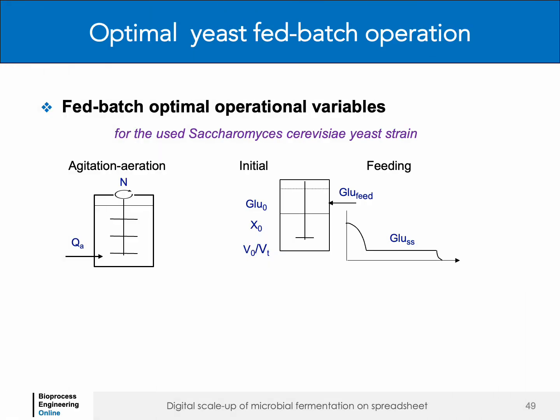The model-based simulations performed in this spreadsheet section make it possible to identify the optimal operating conditions for yeast fed batch fermentation using the selected Saccharomyces cerevisiae strain.